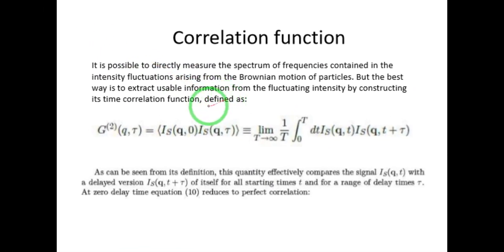Well, this is the formula of the correlation function which is provided in the slides, and you see here that we have the function of the light intensity at one time, and again the exact function at the delayed time.